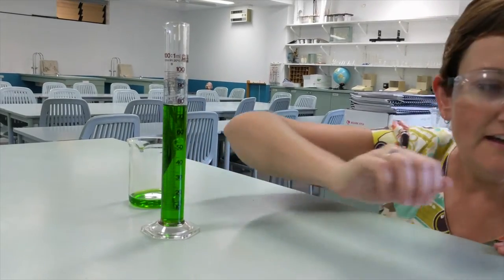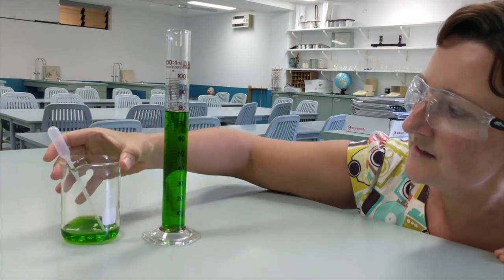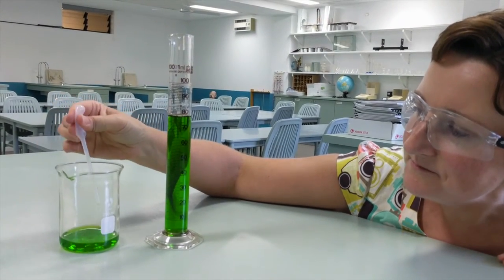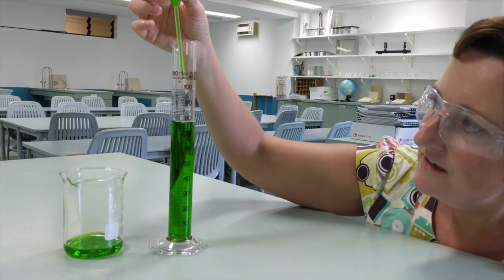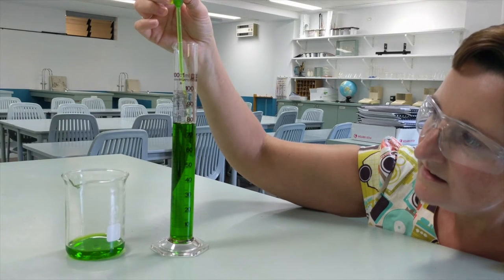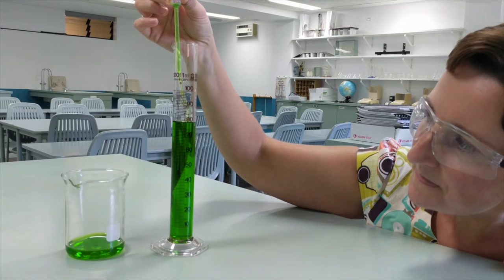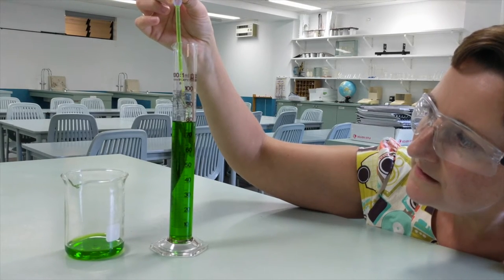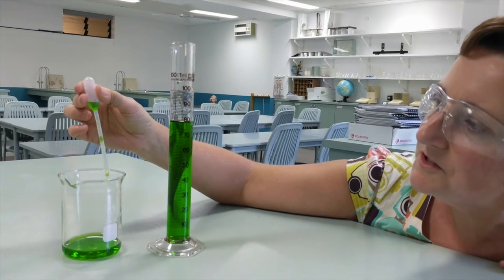In order to add more volume to our measuring cylinder, grab a plastic pipette, get some of the chemical, and then slowly add it to your measuring cylinder until the bottom of the meniscus lines up with the scale of the volume you want.